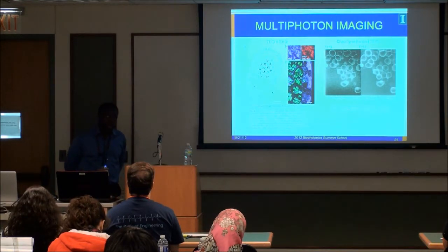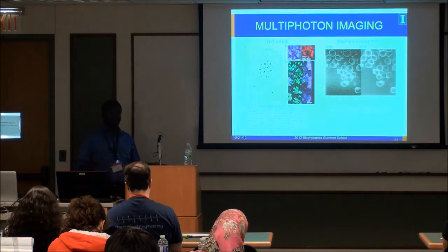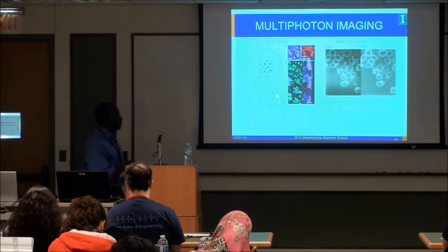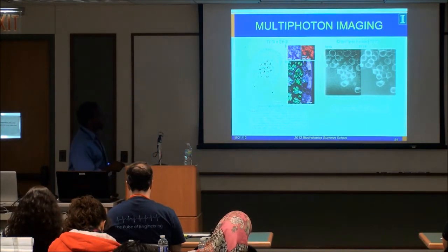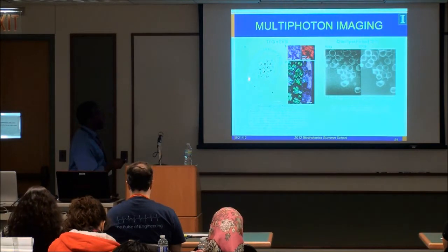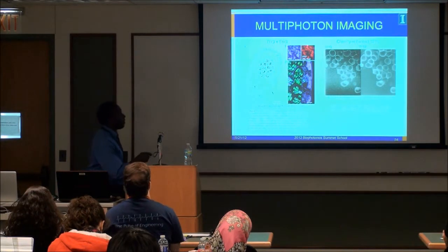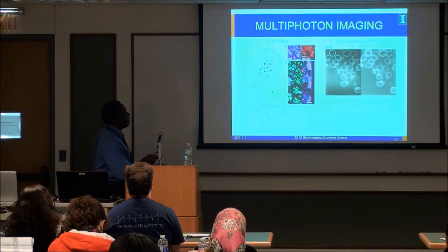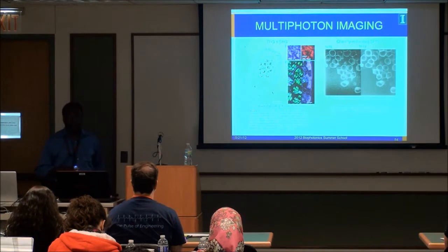of microscopy, like for example CARS, you get some additional signals that come with that technique anyway. So you can get a second harmonic signal, third harmonic generation, of course, two photon fluorescence. These are images obtained from a paper back in '06, where they're looking at plant seed tissue. And A here is third harmonic generation. And again, the third harmonic is sensitive to the interfaces. And same thing here in terms of the B, the purple colors. And green here is the SHG, and red is the multi-photon fluorescence.